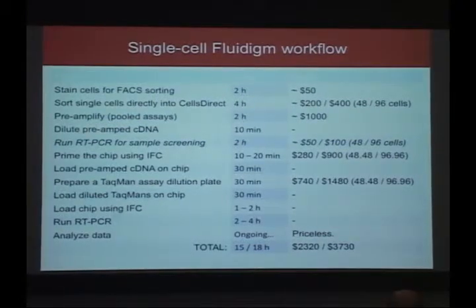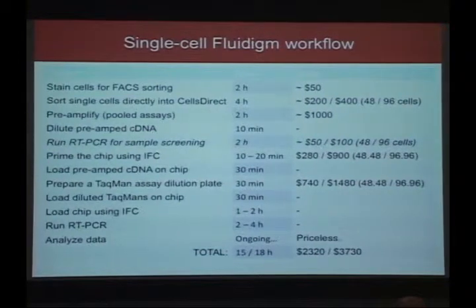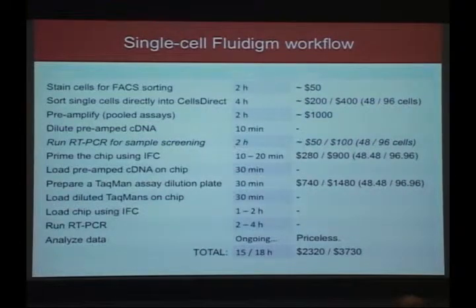But I would also say that this is not just a little tiny experiment we're talking about here. This is a few thousand qPCR readouts for each of these chips. So it comes out actually pretty close to $1 per qPCR reaction, which is not that much.